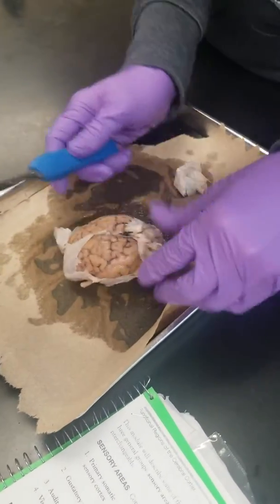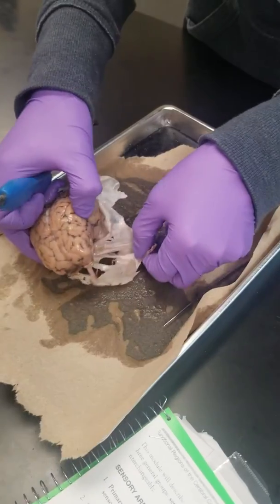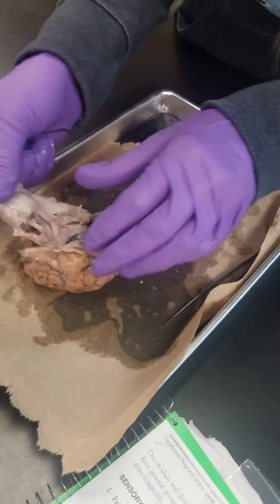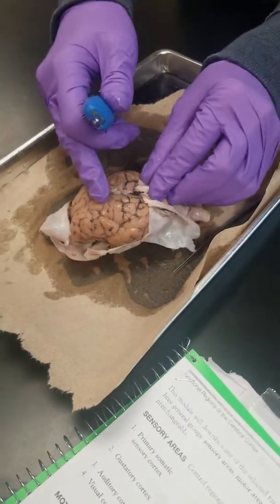See how the dura mater basically extends down the longitudinal fissure and even between the cerebrum and the cerebellum. Right here you've got to be careful. Just keep making that mental note for next class.